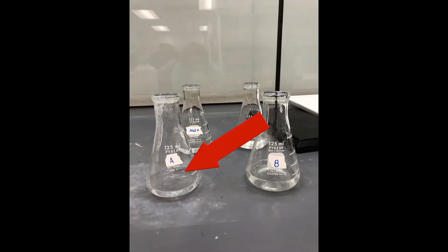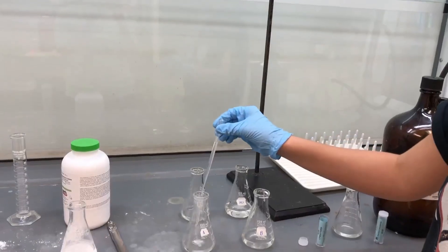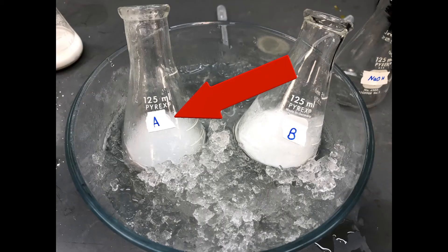For flask A, you will add NaOH until it becomes basic and test the pH as you go. When the pH becomes about 10, cool the flask in an ice bath in order to form precipitate, which will later be collected by vacuum filtration. If the precipitate does not form, add more NaOH.